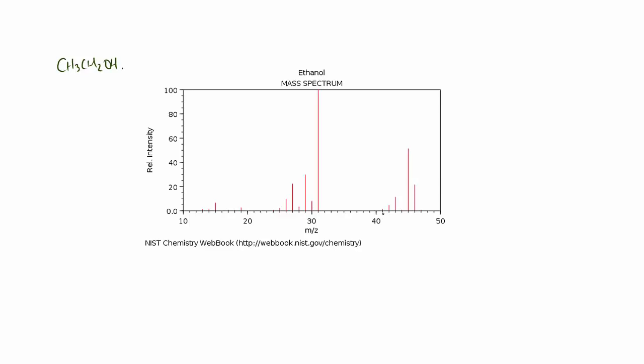Now, the one I'm more bothered about is 1, 2, 3, 4, 5. Is this one here? This one here is due to this particular ion, and this is the molecular ion again, and it has an MZ of 46, 1, 2, 3, 4, 5, 6, which is our Mr of ethanol, and that's from this whole thing here has gone through intact as a positive ion. You can see actually in relative terms that's not very likely to happen.